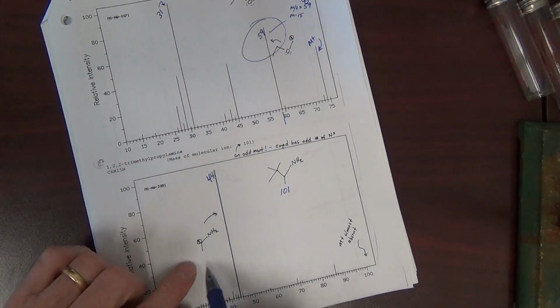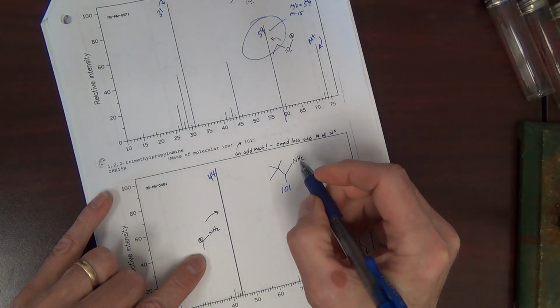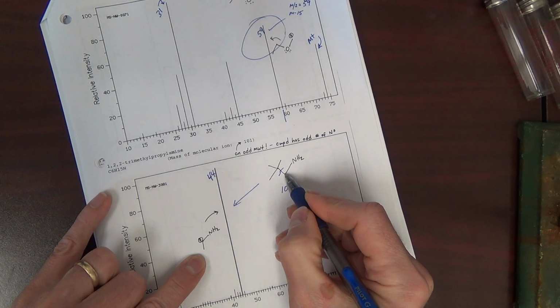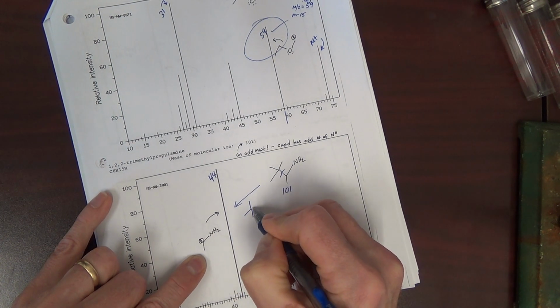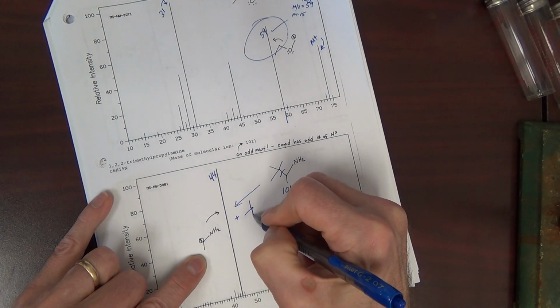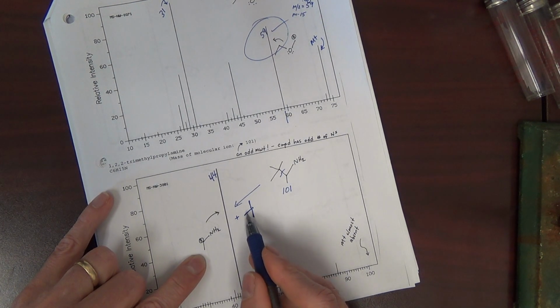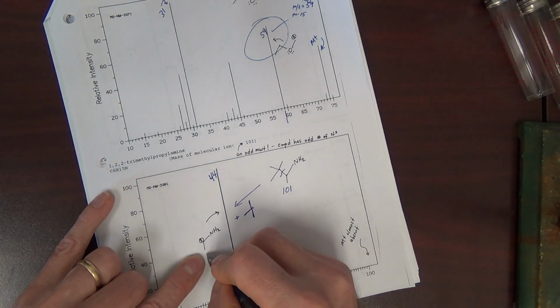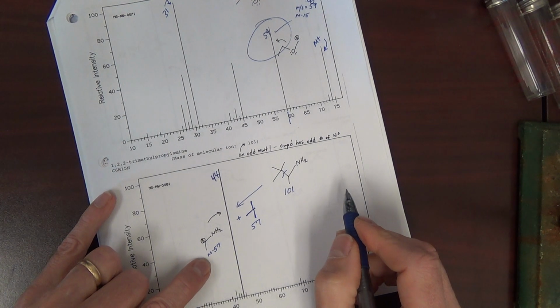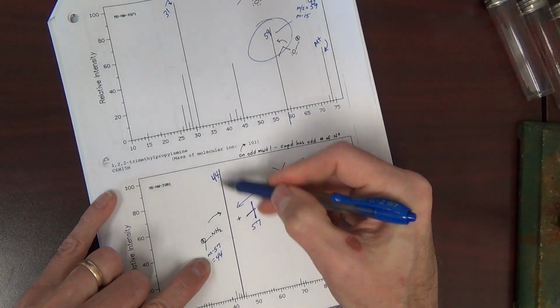Okay, I've already given you the structure here, but basically where can we cleave to give a resonance stabilized cation? We can cleave right here. That would give a cation here, and then we could show the radical there. Now mass, I think that's probably 57. A butyl is 57. That means this is M minus 57. That's such a huge number, I think that's right. 101 minus 57 has got to equal 44. And indeed it does, and that's why our peak is registering at 44.